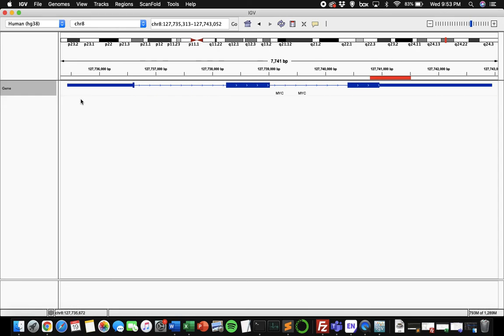So if you're doing this on the entire visible region, these metrics will be output aligned to this gene cartoon, or if you're doing it for the targeted region, they will be output and aligned to only this targeted region. Additionally, you will also be output a 2D structure as a separate entity. It'll be a pop-out window, and that 2D structure can be visible outside of IGV itself. So once all of the scans are complete and everything is output below, you can begin the process of analyzing the predicted structures.